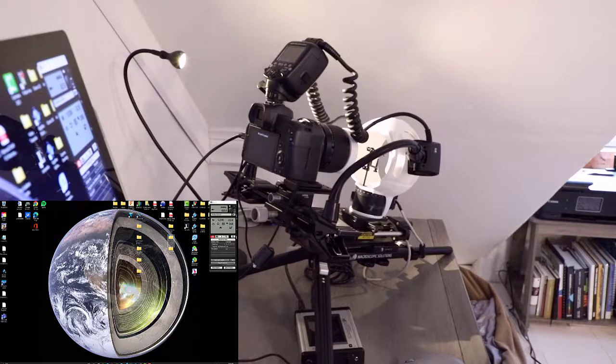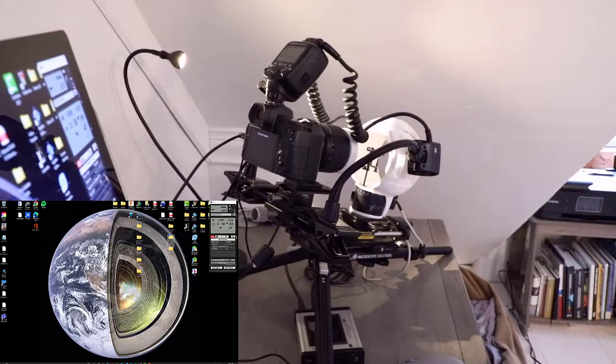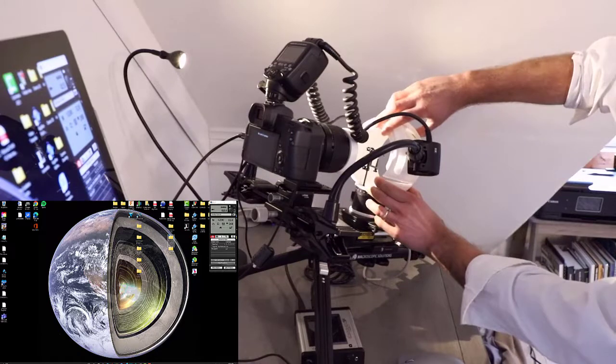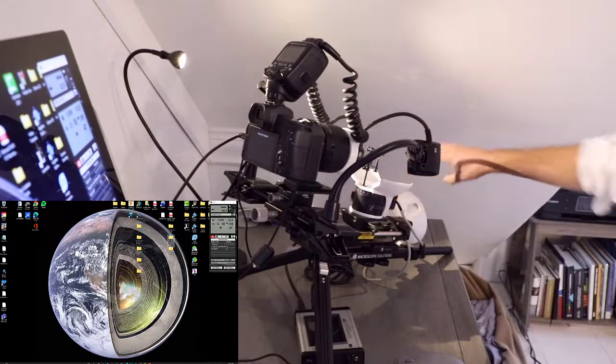So some of these materials are going to prove challenging even for us, and what I'd like to just do is share our method for imaging these difficult specimens with everyone in a public way so that we can all learn and progress from here. So today, what we're going to be doing is taking a photograph of a specimen that's quite dark in color, but also a little bit larger in size.